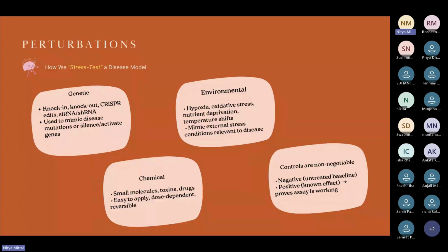And so now your control becomes iPSC. Say you were differentiating this iPSC into a motor neuron, you want to see how well it was differentiated. So your control here is just a pure 100% iPSC versus a day 3 motor neuron versus a day 10 motor neuron. And all three of these different cell types at this point are going to express different markers.